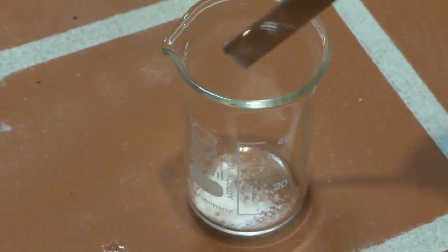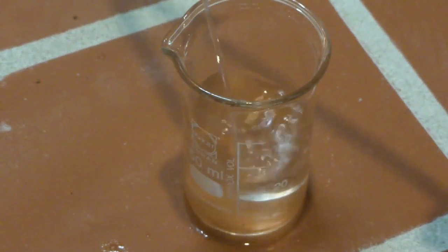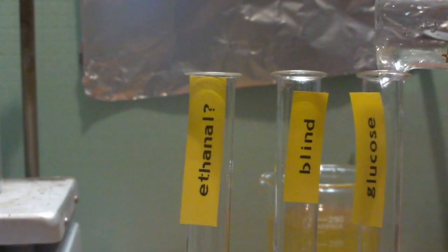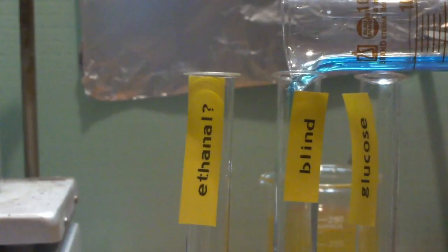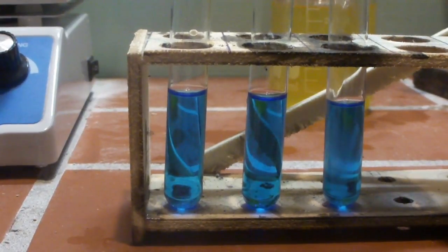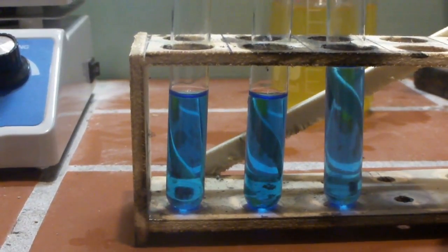Next, dissolve some dextrose in water. Our Fehling's solution is then added to three test tubes. To obtain accurate results, we perform the reference test with glucose, as this will give a positive result. We also perform the so-called blind test, which shows us whether the test solution itself is okay to use. To the third test tube, we add some of our acetaldehyde solution.